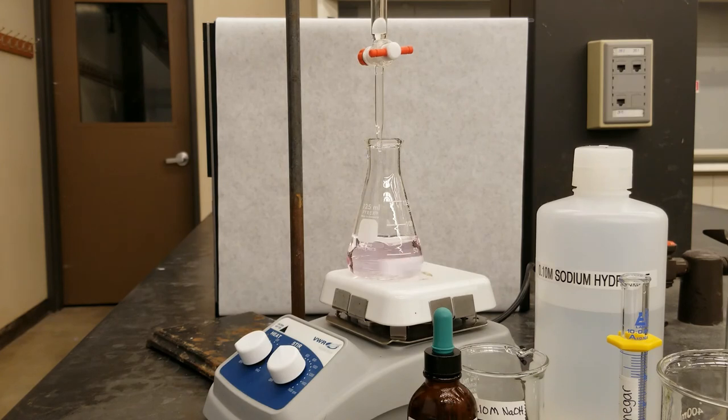And once again, once we've reached our equivalence point, our solution will turn a very faint pink color. And so our final volume is 44.5 mils.